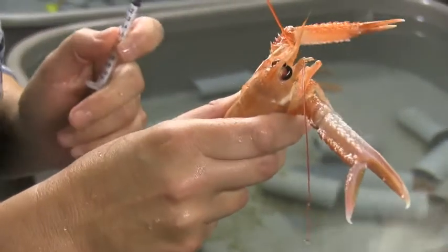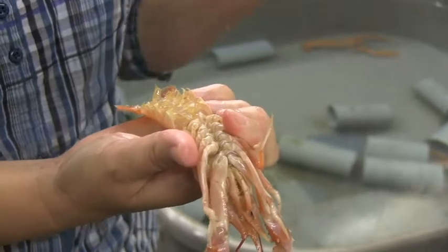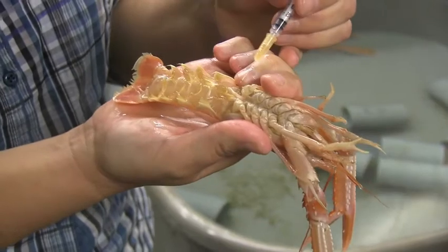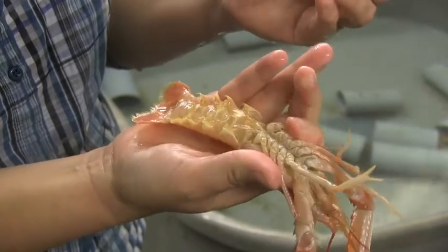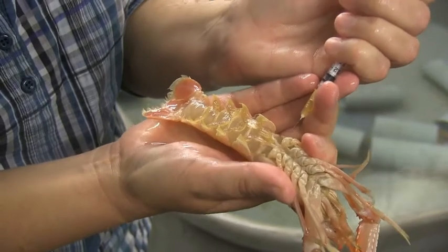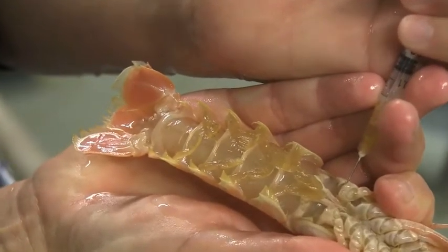Since crustaceans have an outer hard shell, in order to get a blood sample you need to get through that shell. There are a couple of places where it's easy to go through the integument where they don't have that much. So here is a soft spot — this is the perfect place to take a blood sample. You just insert it under the integument, and up comes blood.